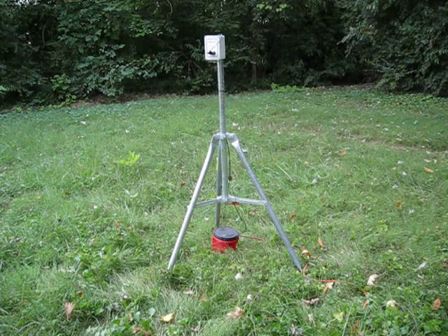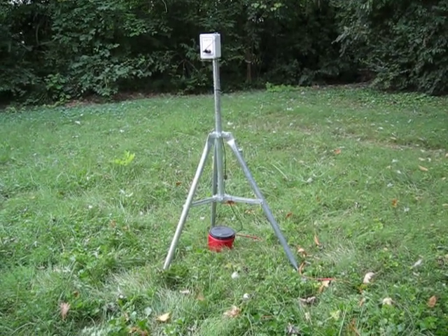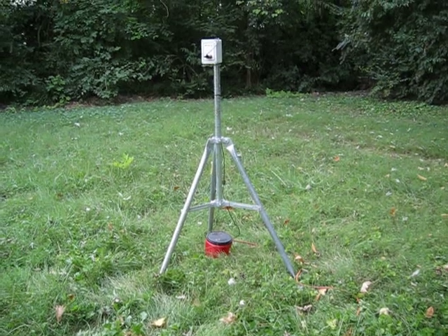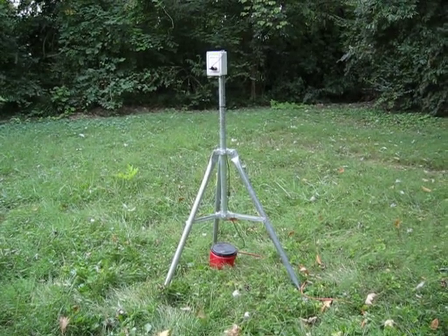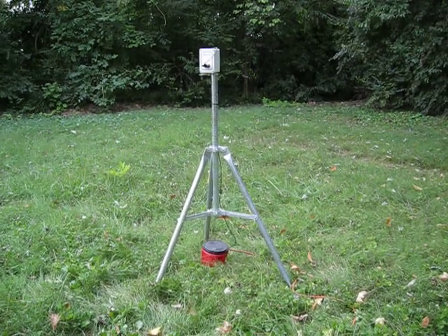We have connected the system to regular household 120 AC current. The red plastic can contains a power supply that allows us to do this. You can also run the unit using a 12 volt battery.